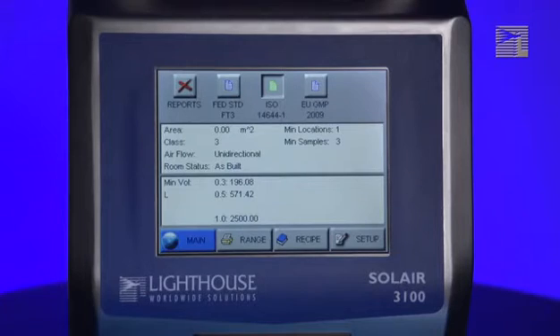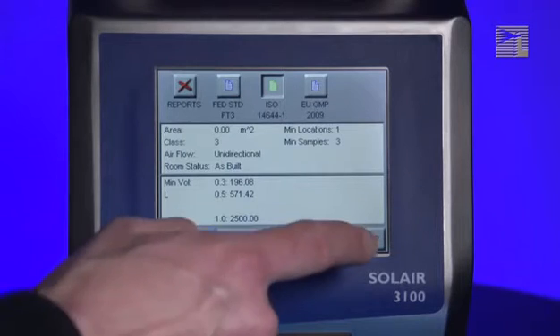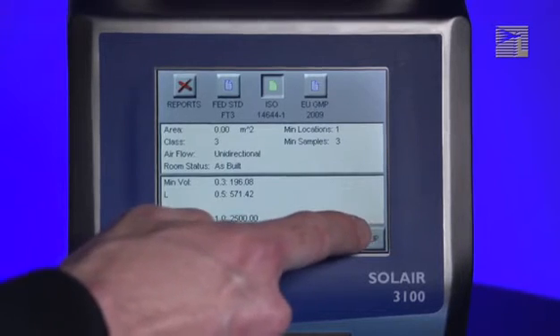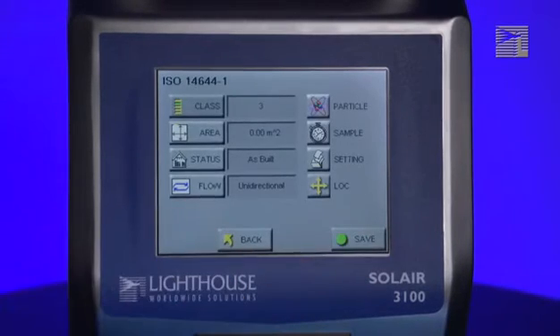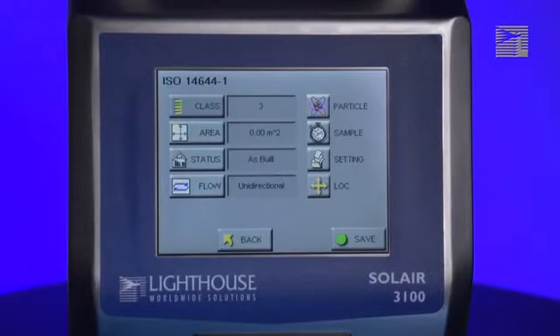To set the parameters for the report, press the Setups button in the bottom right corner of the screen. The setup parameters will change depending on which report type was chosen.